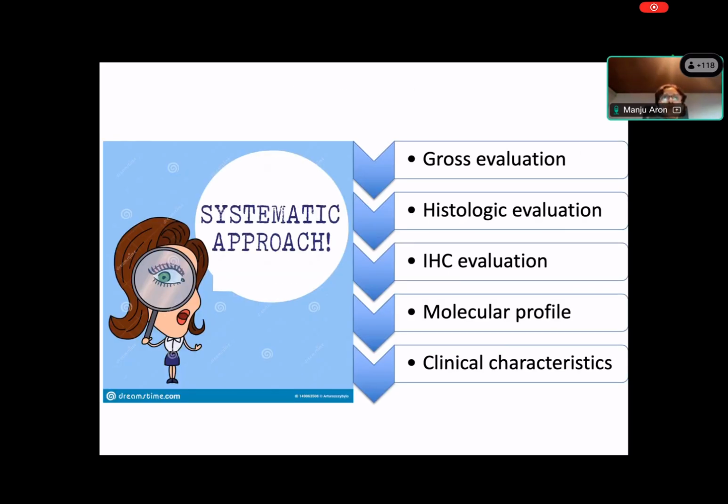Now, for the pathological diagnosis of these tumors, it's very important to have a systematic approach. And this actually holds true for any tumor, right? You want to evaluate it very carefully during gross exam at the grossing table. So the prosectors who are handling the specimens are the ones who are really contributing a lot to the diagnosis and staging of these tumors. So the gross evaluation is extremely important.